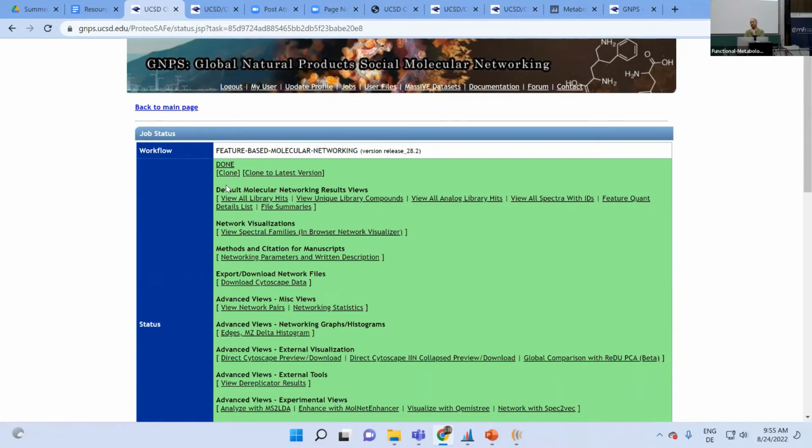You mean redo? Oh, review, yeah. Before you report this in the main text of your manuscript, I would strongly suggest you do that. In fact, I would put all the mirror plots of molecules discussed in the main text into the SI. Be transparent. Or with the USI, you can even share the URL.